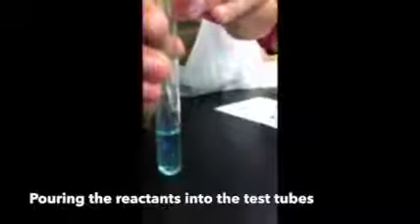As we started pouring the solutions in the test tubes together, they started making some sort of precipitate. The first 4 test tubes had a small amount of precipitate. The tubes were perfectly fine after mixed, but the last 4 seemed to form a huge amount of a dark green precipitate.